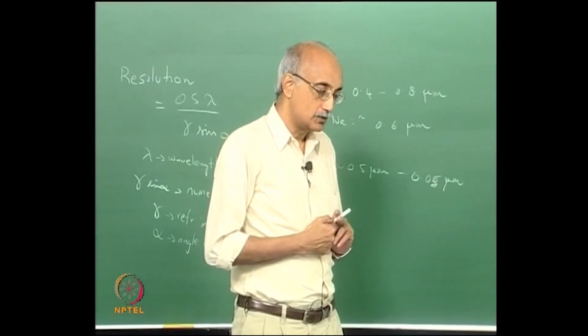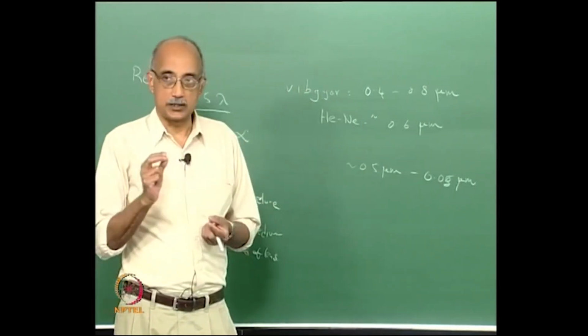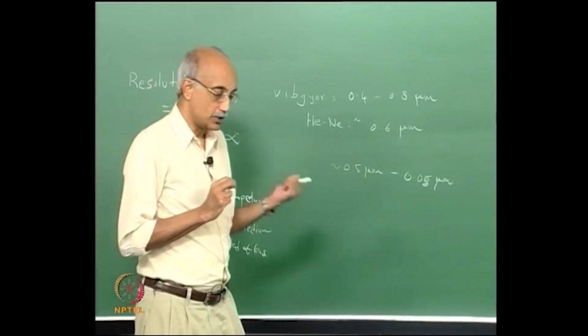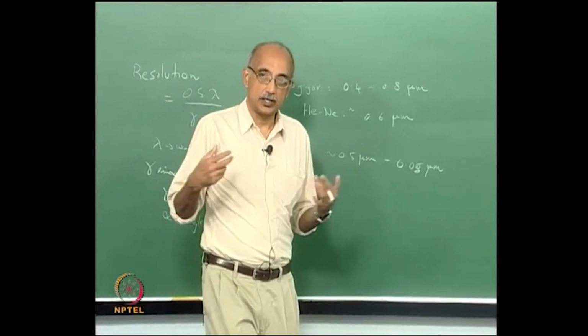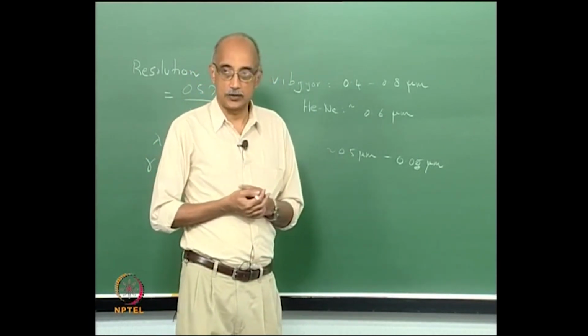Now, when we do optical microscopy, there are essentially two ways in which microscopy can be done, and that has to do with lighting. I mentioned that resolution is now being improved by looking at other factors that influence the operation of the instrument, and light is certainly one of them.